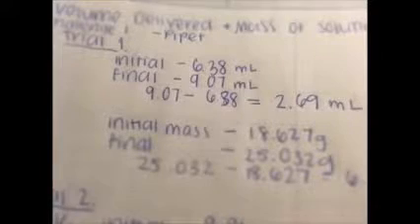Here, the initial volume was 6.38 milliliters. The final volume was 9.07 milliliters. The delivered volume was 2.69 milliliters.